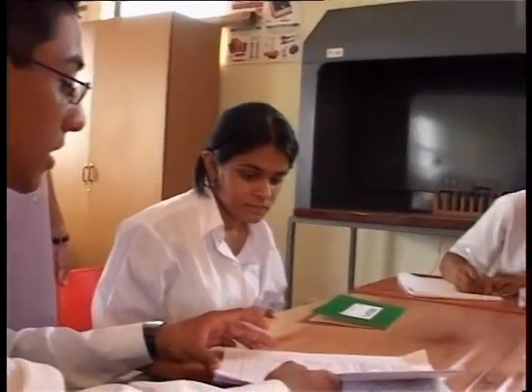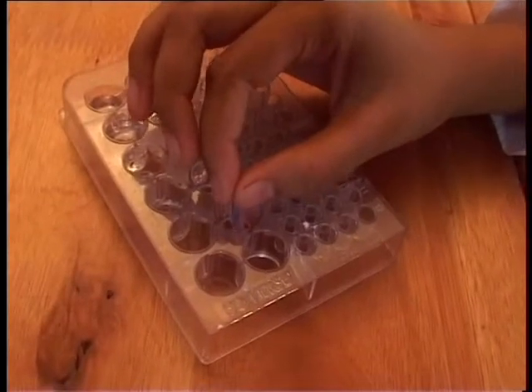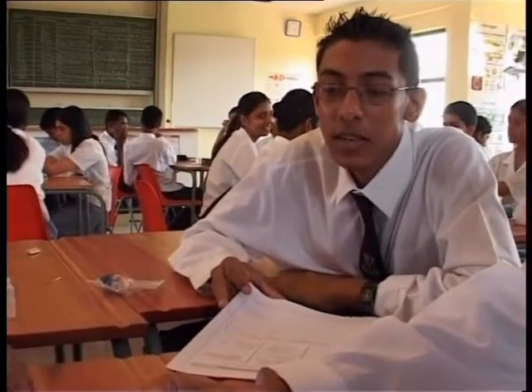Blue litmus paper with substance D. In the first test, blue litmus paper is put into the aqueous solution. We observed that the blue litmus paper turned red, which proves that substance D is an acid.